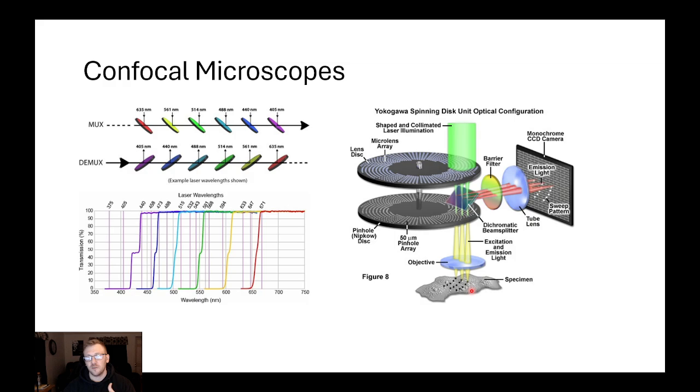By using confocal microscopy, we're able to get specificity of our focal plane at different depths in our sample, so that we can see things not only in X and Y, but in Z axis as well. And if you take a sampling size that gives you perfect alignment of your Z axes, we can see things in 3 dimensions, which is really powerful because biology happens in 3 dimensions. Very rarely are things flat when we want to look at them.